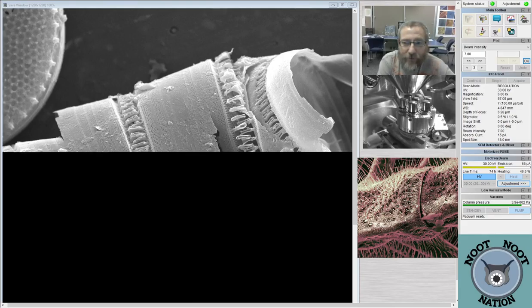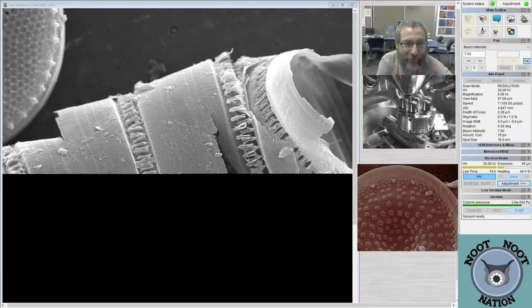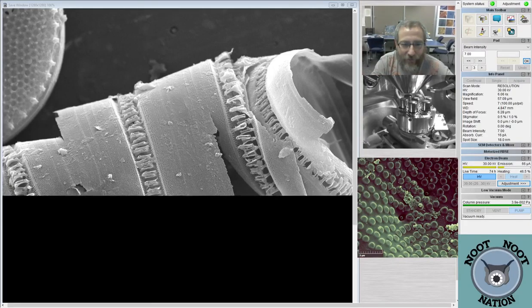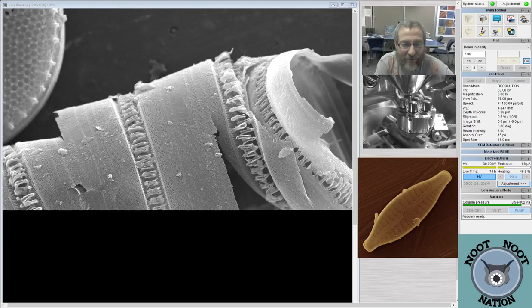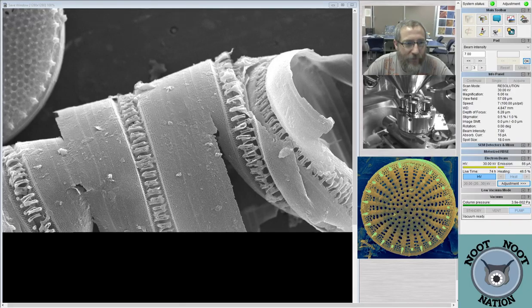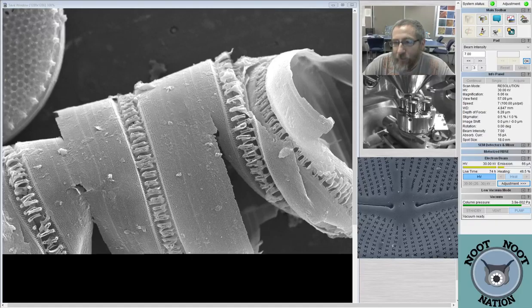I also found, while I was browsing around a little bit earlier before the stream started, a different kind of Ditylum. And I did not take a picture, but hopefully I can find it again. Because instead of having the little eyelash spines around the outside, it had sort of a straight sheet, like a fence that went around the outside edge. Which was really, really weird. And I was like, oh, what's this? But it was definitely Ditylum. It had the sort of pokey bits that come in a long spine, triangle shape. It had all the other things, but it had a totally different fringe. Wow. Oh, that would be cool.